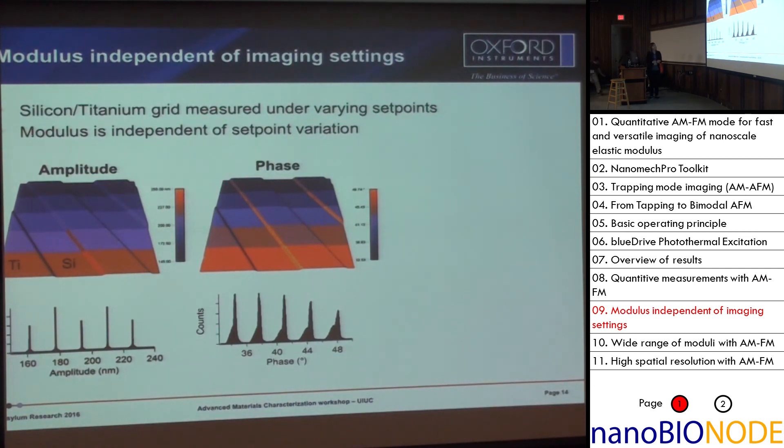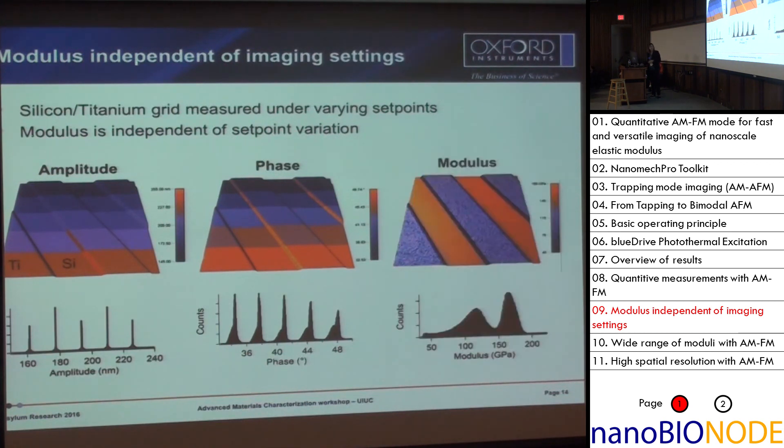Here I wanted to show a sample that is much stiffer — a silicon wafer patterned with titanium stripes. You can see the stripes going diagonally. The color you're seeing is me varying the amplitude set point during the image, and in phase you also see horizontal stripes from changing imaging settings. But if you go ahead and calculate the modulus, you can clearly see that the modulus is not changing during the experiment. In orange you have silicon, and in blue are the titanium stripes. The histogram on the bottom shows we are able to differentiate between the two materials very well.